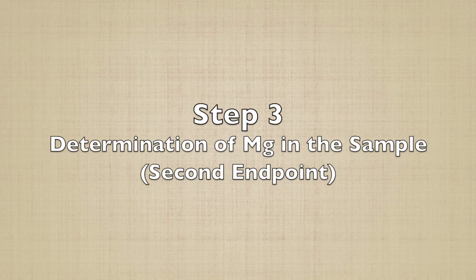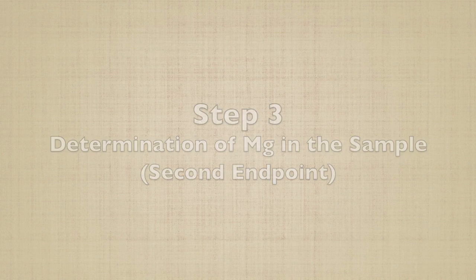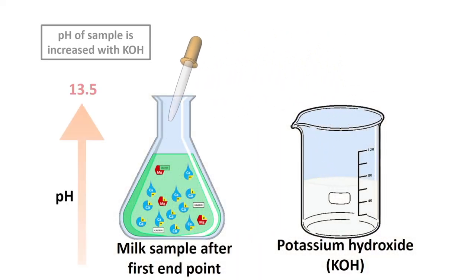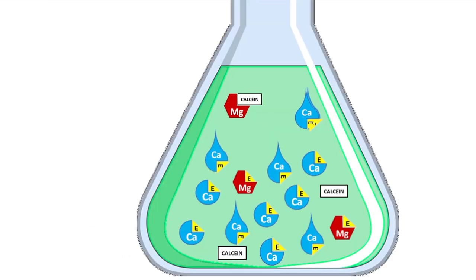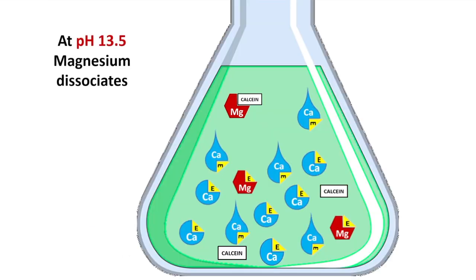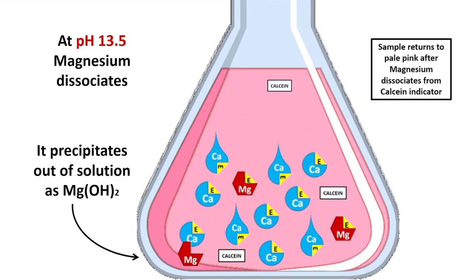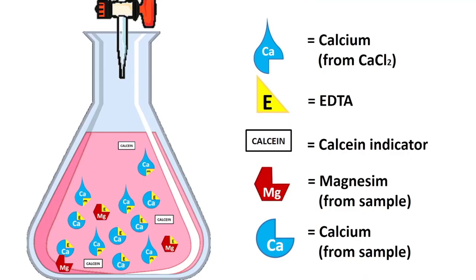The next step is to determine how much magnesium is in the sample. By adding an additional amount of potassium hydroxide to increase the pH, the small amount of magnesium bound to the calcein indicator is now dissociated from the indicator and precipitated as magnesium hydroxide. Since the amount is very small, you do not need to take that into account in the calculation. Now, since all calcein indicator is free, the solution will again turn pink. Perform the back titration with calcium chloride.